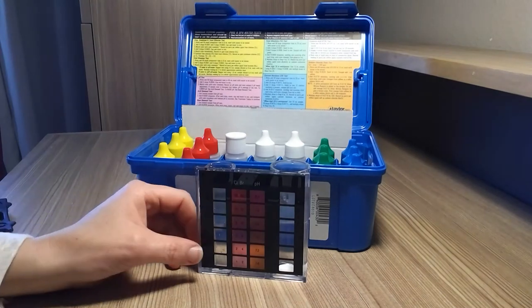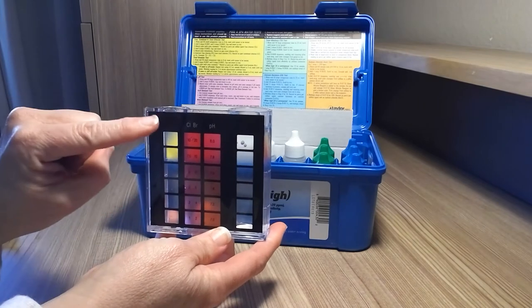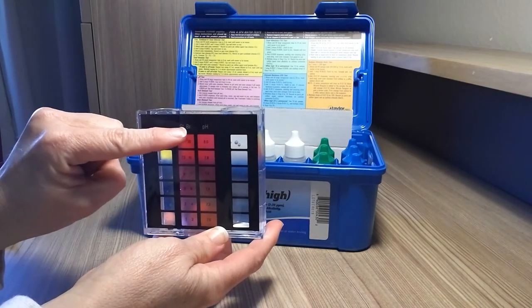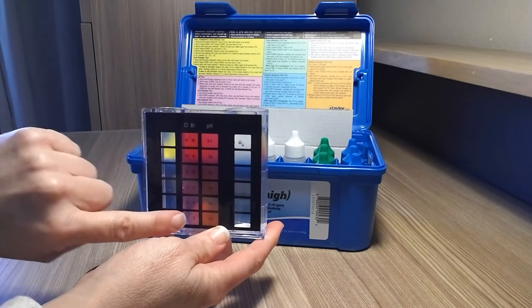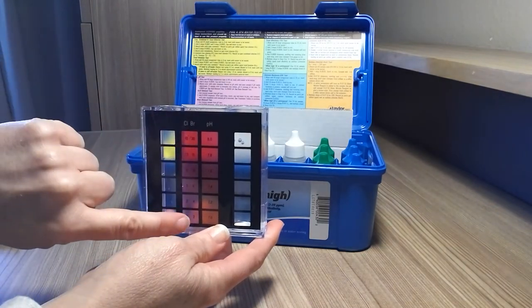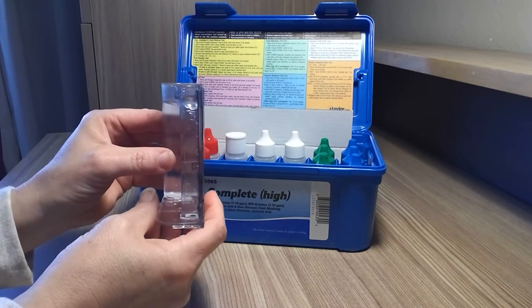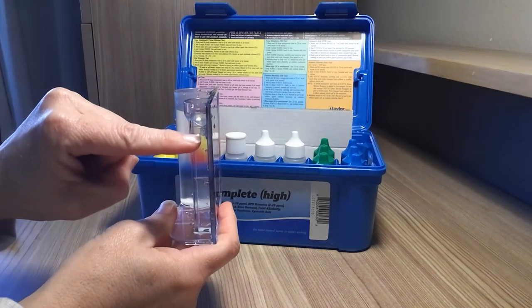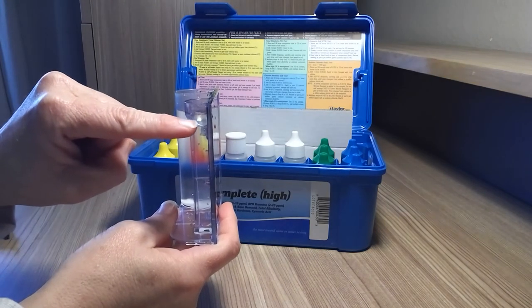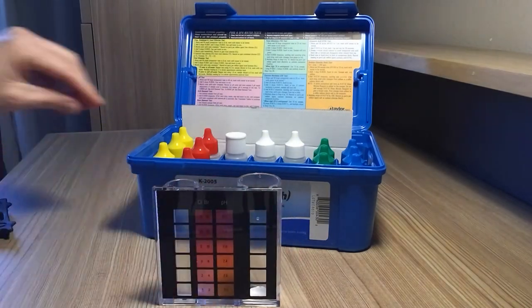So we're going to do bromine first. You're going to use your container. On the bromine side, there is a chlorine side and a bromine side — bromine is the sanitizer that we're using, so we're going to read the column below bromine. I already have gotten my water from my pool area. You're going to fill it up to the 9 mL mark — there's a mark right on the side just underneath this lip.